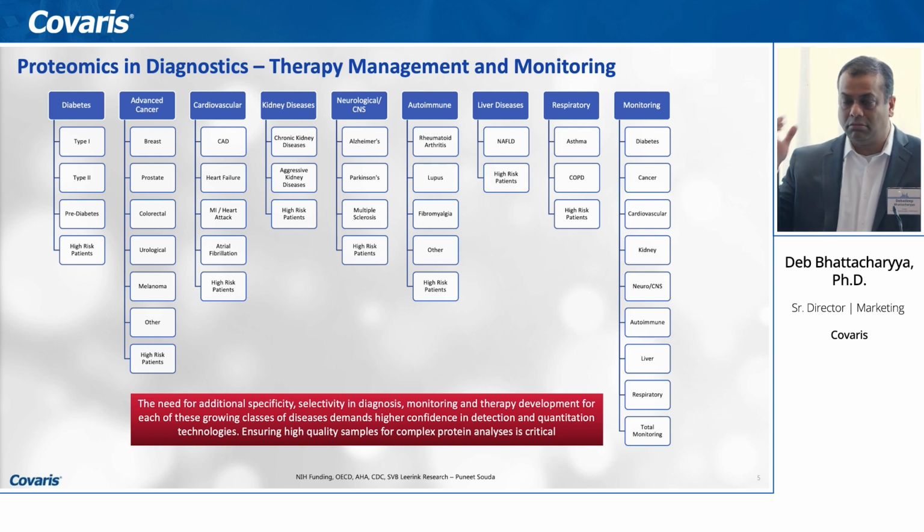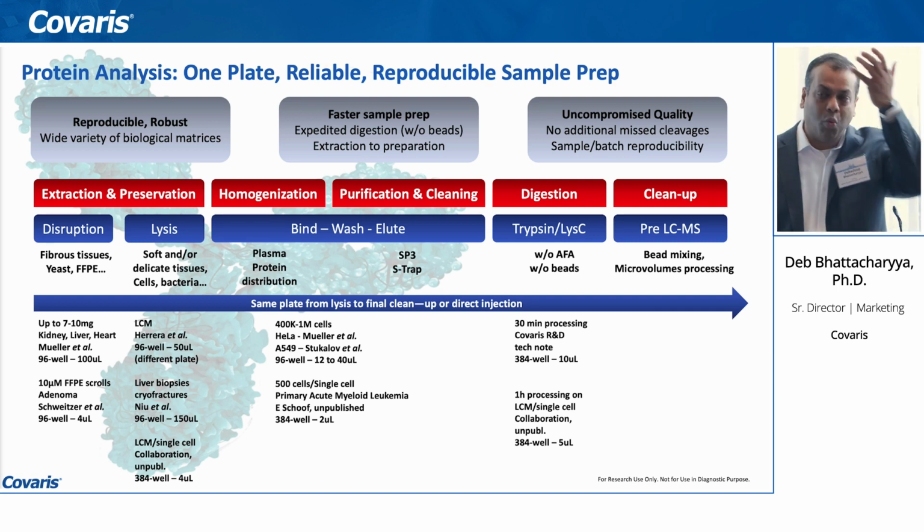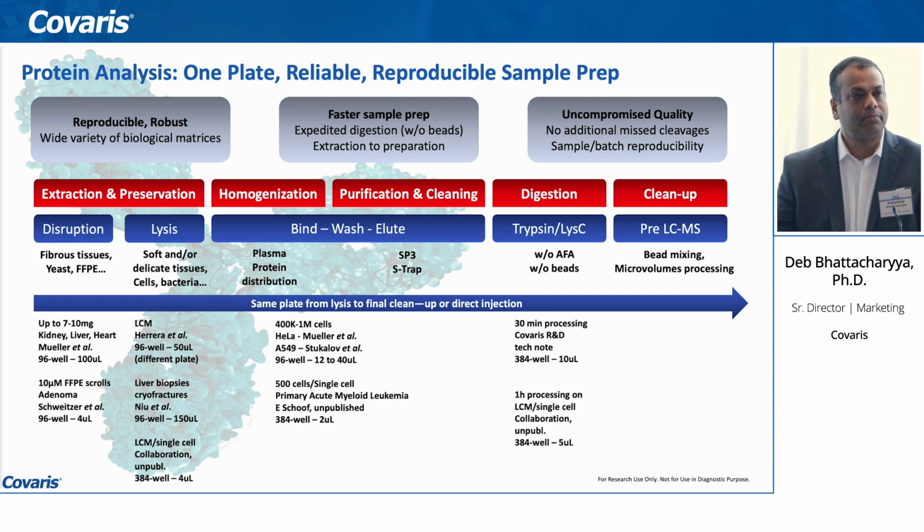And actually, I would not go too much into this because I don't want to steal Saeed's thunder, and he's going to focus on specific application areas that he and his lab have been invested in. But what we have developed is basically a one-plate workflow.